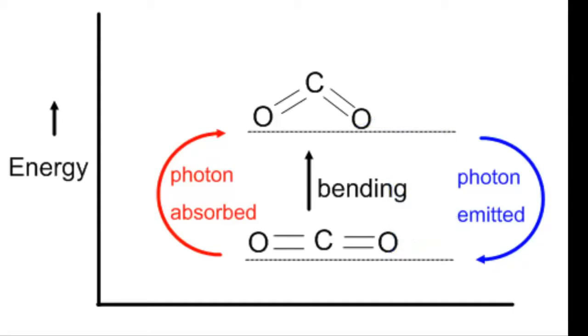Within organic molecules, many of the bonds that we find have vibrations which have photons that fall within the infrared band of the electromagnetic spectrum.